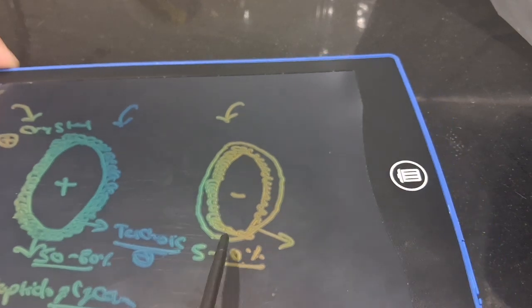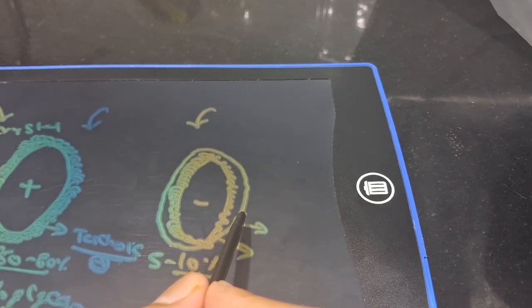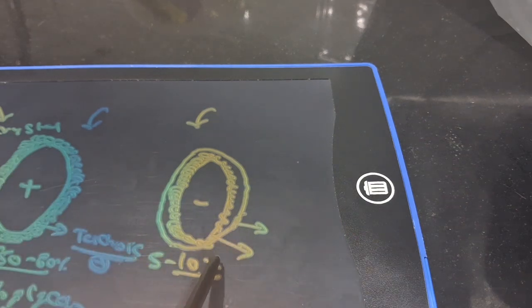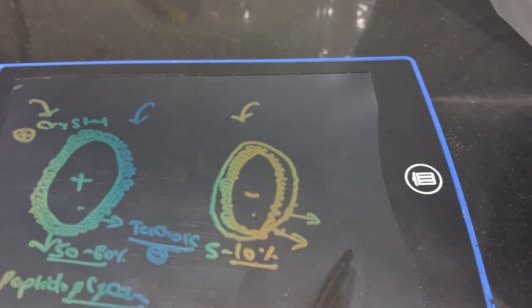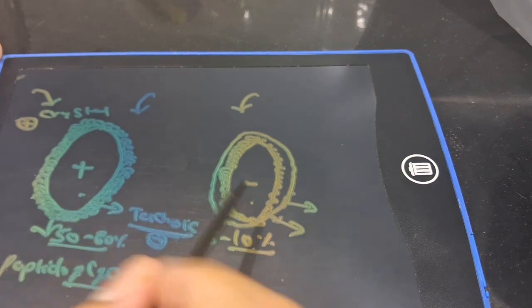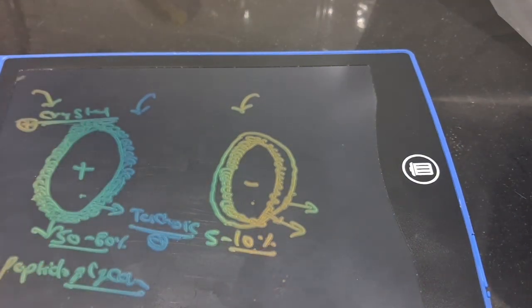The same thing will also happen in gram-negative, but the outer membrane works as a barrier. Because of this membrane and a thin peptidoglycan layer, crystal violet combines with the teichoic acid very loosely. But after the crystal violet staining, if you observe the slide under the microscope, you will see that both gram-positive and gram-negative bacteria look purple because of the crystal violet and the negatively charged teichoic acid present in the peptidoglycan layer of the bacteria. So after the first step of crystal violet, there will be no difference between gram-positive and gram-negative bacteria.